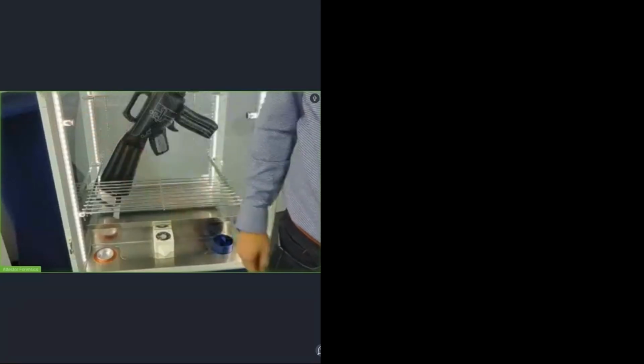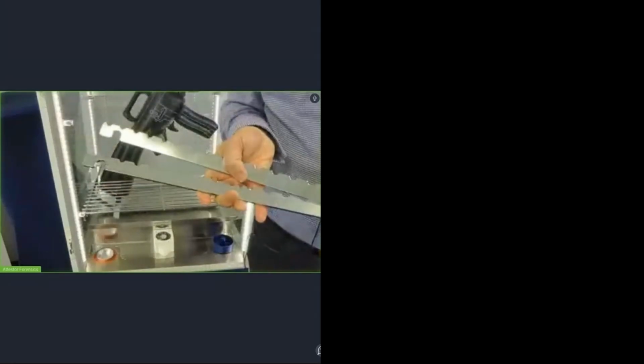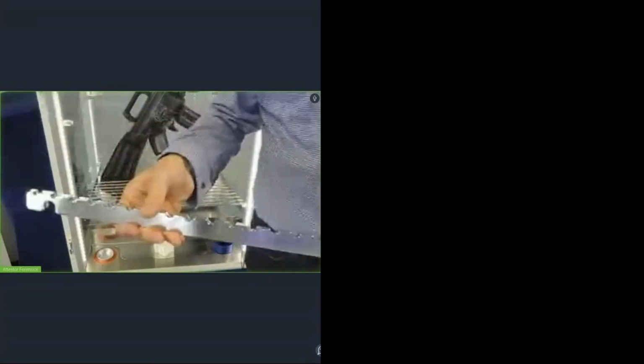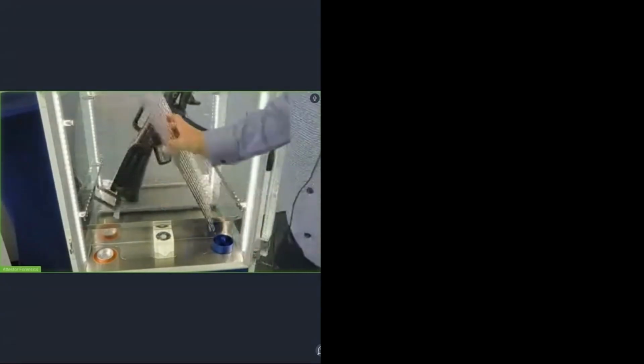The only thing that's a bit disturbing is this kind of knob that comes out. But if you want to clean that one, don't tell my R&D guys. And don't take them out, all of them at the same time, because then the glass will fall into the chamber. But you can actually take that off so you have a smooth surface, and then later on you screw that in again. All of that material, also the shelves, are made in material and in size so they fit into a laboratory dishwasher. So you don't have to manually clean that stuff. You just put it into a lab dishwasher and get it cleaned automatically. There is enough in the cabinet that you have to clean. Let me take out my machine gun.